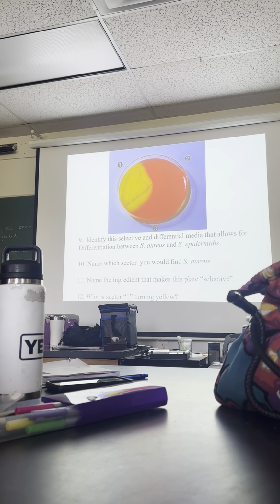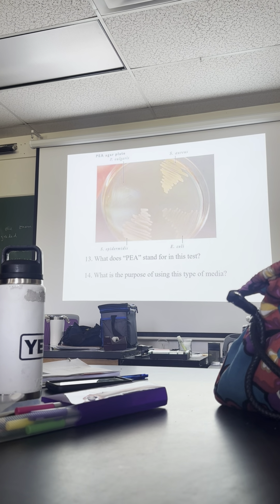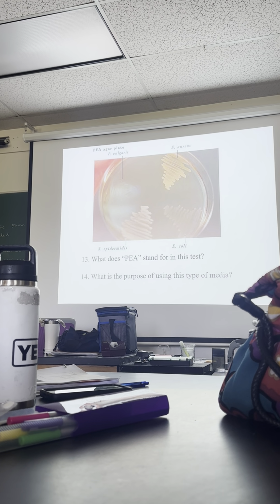Okay? Here we go. PEA, some questions will be quite easy. What does PEA stand for? Phenylethanol agar or phenylethyl agar, both of them are good. And what's the purpose of using this type of medium? It inhibits gram negatives, so the gram positives grow here, and it gives you an opportunity to acquire gram positives, especially if you have very aggressive gram negatives. And there are some aggressive gram negs. There's also one very aggressive gram pos.